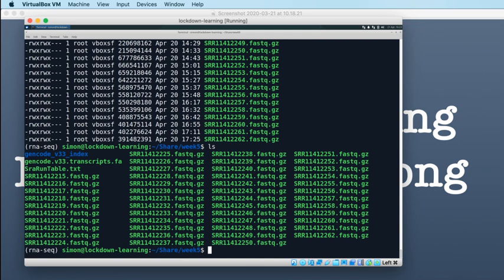And so in order to do that, we need to think about how to get from our SRA run table, which has 48 entries, to a list of the GEO accessions, which tells us what our 12 samples are, and then to get back from those 12 samples to which 4 files belong to each of the 12 samples. We've got to do a little bit of gymnastics here, which will feel a little bit redundant, but I want to keep this SRA run table as much as possible as our reference point for this experiment.